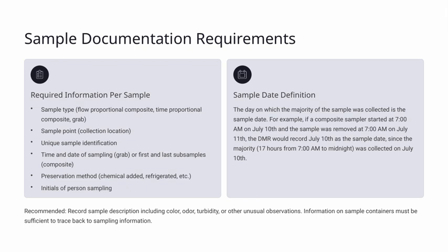Proper preservation ensures the integrity of the sample until analysis. The initials of the person collecting the sample should be recorded as well, providing accountability and traceability. Now about defining the sample date. It's based on the majority of the sample collection.